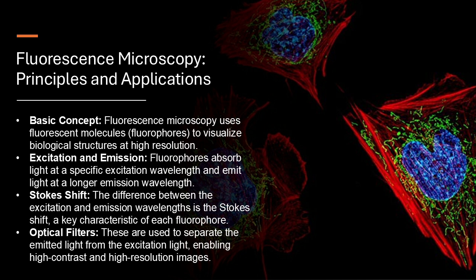These techniques use some ingenious tricks, like switching the fluorescence of individual molecules on and off, or taking advantage of the way they emit light to bypass the diffraction limit. It's like using a special kind of pointillism to create an image with incredible sharpness. So we're basically taking multiple snapshots of these tiny blinking molecules and then using clever algorithms to reconstruct a super sharp image. Exactly. That's brilliant. And the implications are huge.